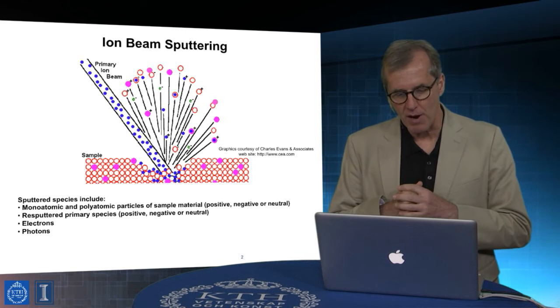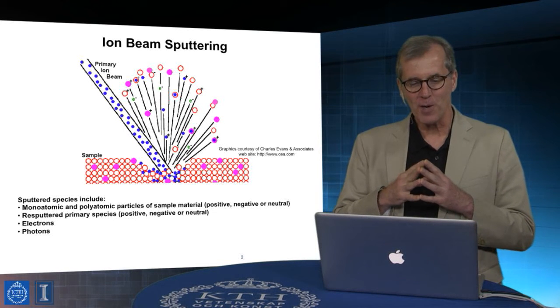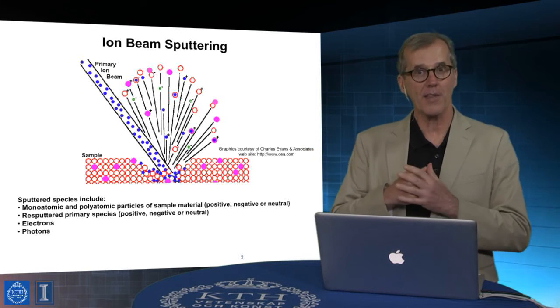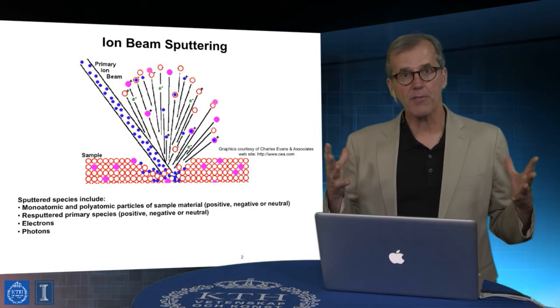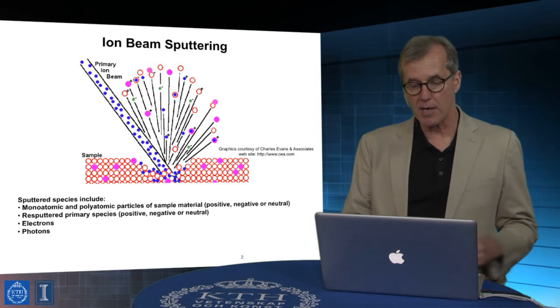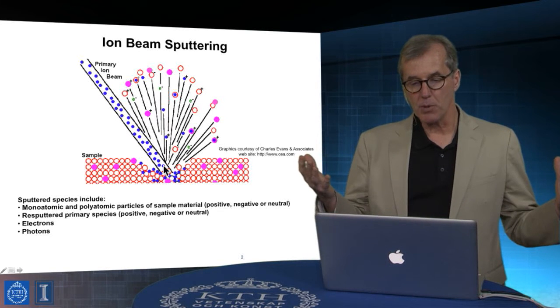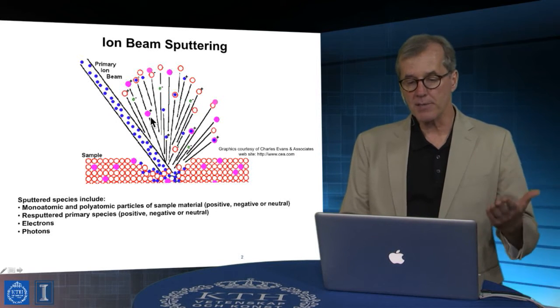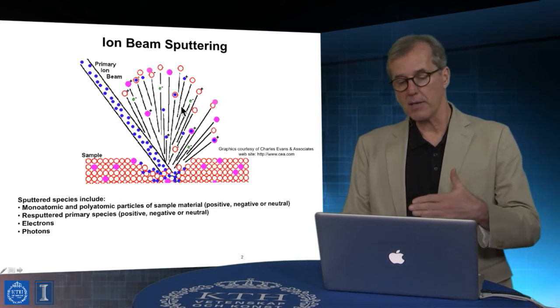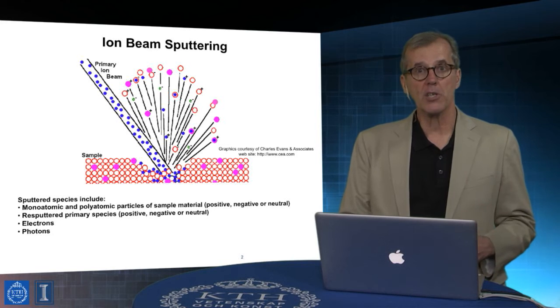Well, this isn't quite that catastrophic, because it's a much more microscopic transformation. But the ion beam comes in with enormous energy and then fundamentally alters the world that it interacts with by ejecting from it all kinds of components. And what you see here is a primary ion beam coming in, indicated in blue. So we see this flux of ions coming in, and out of the sample come electrons, positive ions, negative ions, neutrals. And these positive, negative, neutral components can actually be of very different and wide-ranging masses.